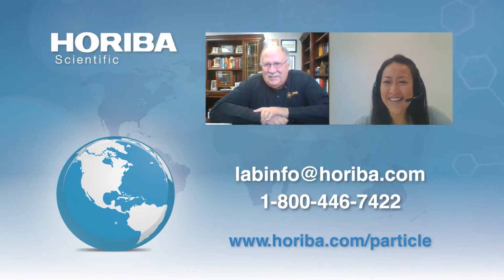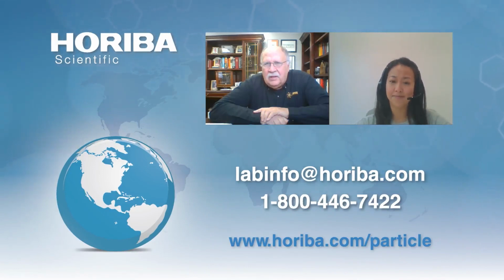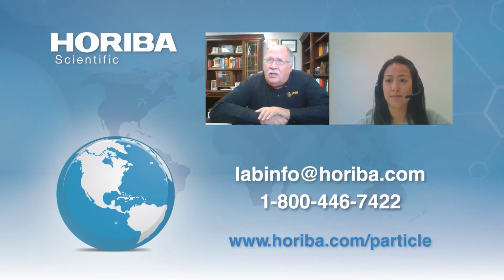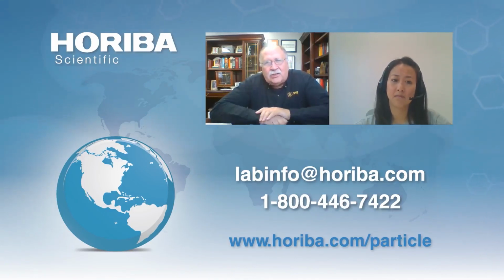Okay. The next question is, and I'll honor your time, I'll take maybe two more questions and we'll wrap up. What is the best test method for nano-sized material in slurry? We're typically going to use a dynamic light scattering system to measure particles. We've found consistently that's the best one to use. The one challenge is, do you have to dilute your slurry sample to get it to a low enough concentration to be used? And we all know that nanoparticles, when you dilute them, can change the aggregation. And so there's always that challenge.